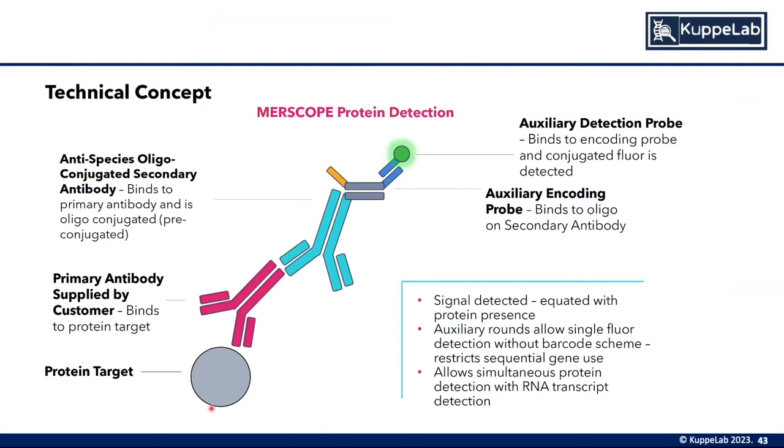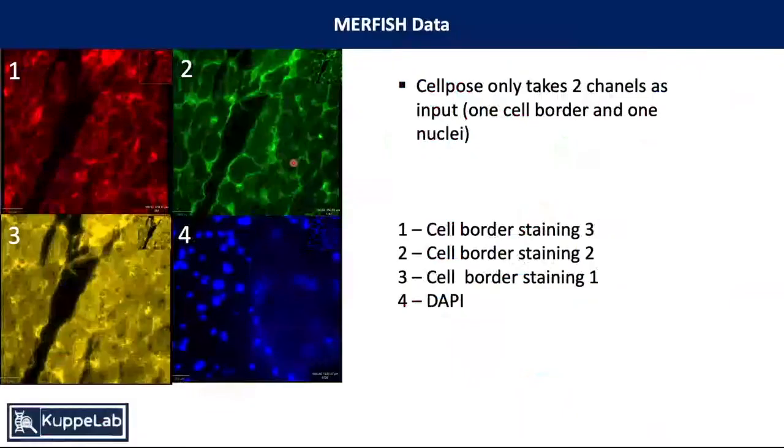And it works in a way that you establish a staining with any primary antibody. You just have to make sure that this primary antibody is carrier-free, so you don't bring any RNases into your MERFISH workflow. Then you use a secondary antibody and imager construct provided in a kit to detect the location of these primary antibodies. And I'll show you some examples of those stainings in a moment.